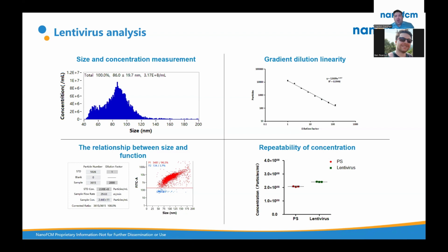These lentiviral particles are often mixed with other similarly sized particles, but we're going to find that our co-isolated particles, those which display the multiple components we need to be active, are going to be uniquely sized relative to the greater range that looks typical of many cell culture experiments. And then repeatability here of concentration, this links back to the standards. By using routine standards, we achieve really nice reproducibility of our concentration measurements across different batches, days, etc.